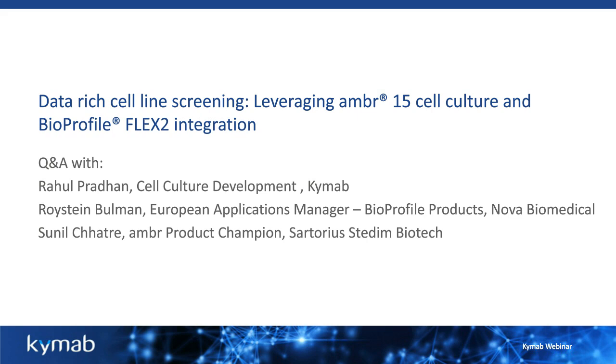Just going through some more questions that we have. So we have a question about the implementation at larger scale. I'm just going to read this out. So I'm keen to implement this at our large reactors up to 2,000 scale. Does the distance from the reactor to the Nova, that is the FLEX2, affect the sample data reported?